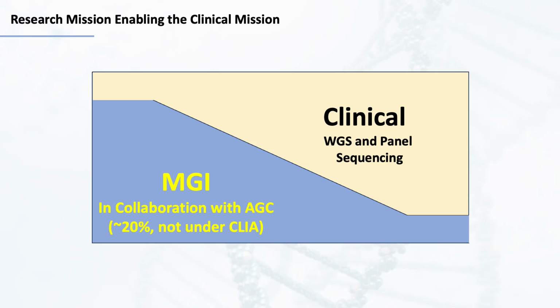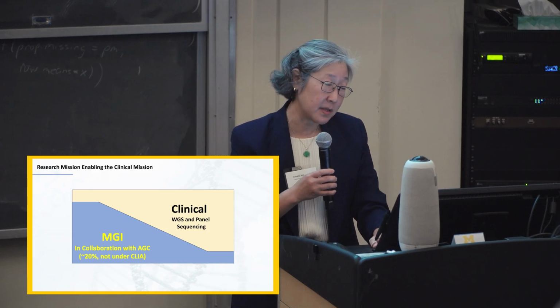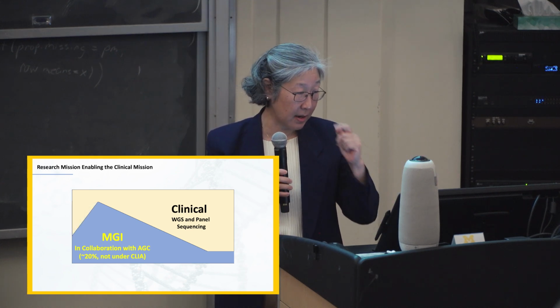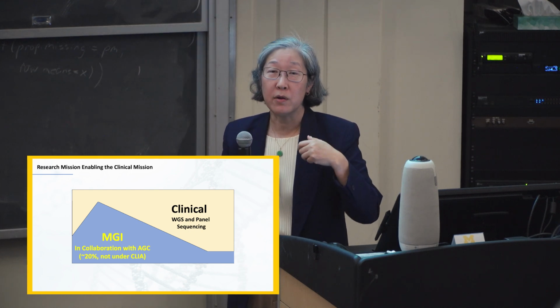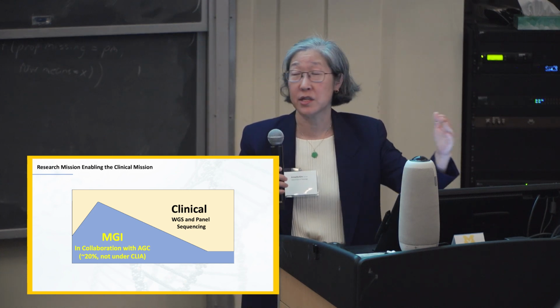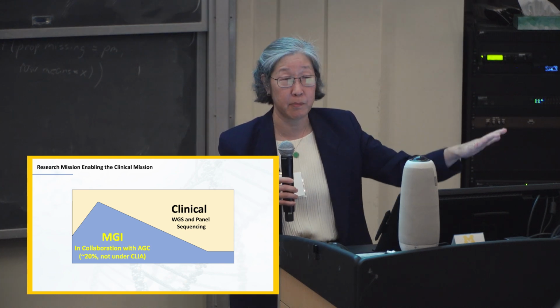And just as a final slide, very conceptually and not drawn to scale, because the Michigan 100,000 compared to our, let's say, 5,000 to 6,000 samples a year doesn't quite compare, the timing would be perfect. It would allow us a gradual, slow start to our MGI uptake, but then we could do massive MGI sequencing while we bring on all of these clinical assays. We are currently sending out whole genomes, whole exomes, and some of our cancer panels. We would be bringing all of that testing in-house with the availability of our panels, and so our testing volume clinically would go up as the MGI volume returns down to the steady state after we get through the retrospective cohort.